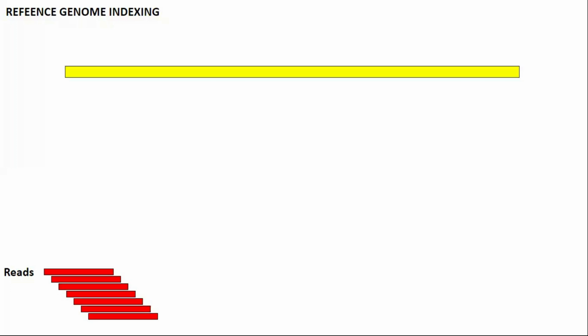Okay, so we will be using STARsolo or the STAR tool, which is very effective, and it follows a specific algorithm. There are different principles related to genome indexing, where different tools take different approaches. There is the Burrows-Wheeler algorithm, and there is the suffix array algorithm. Different tools use their own algorithms and principles, but you have to understand the basic logic behind genome indexing.